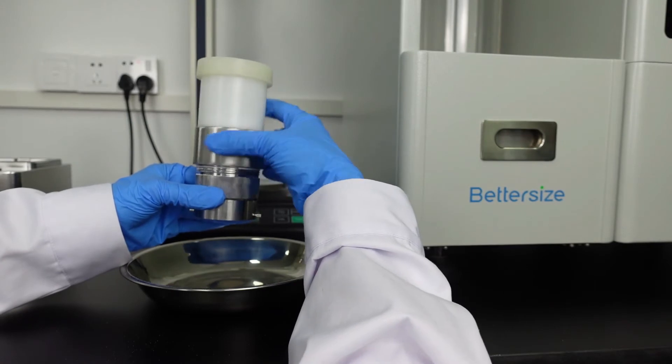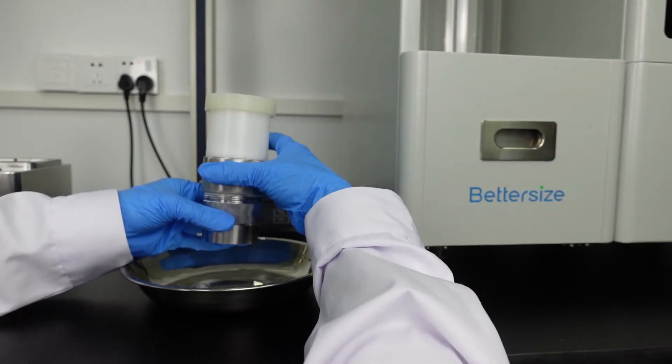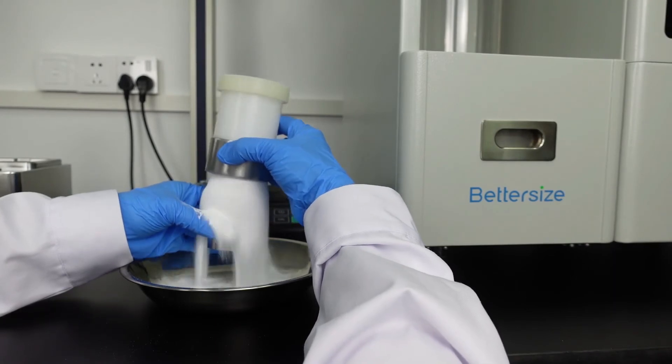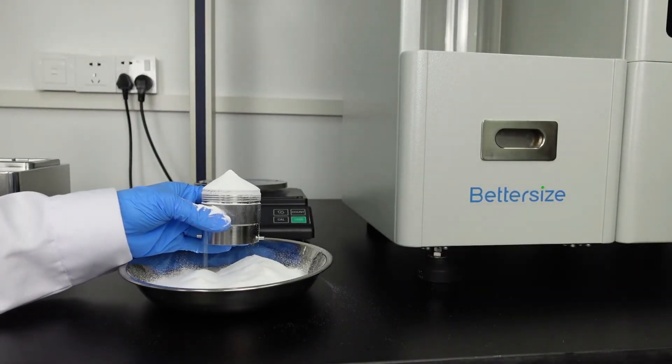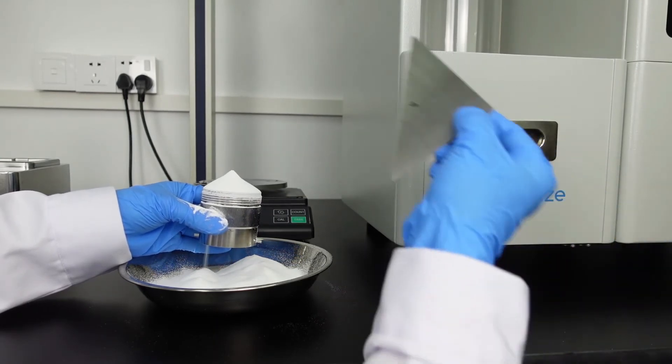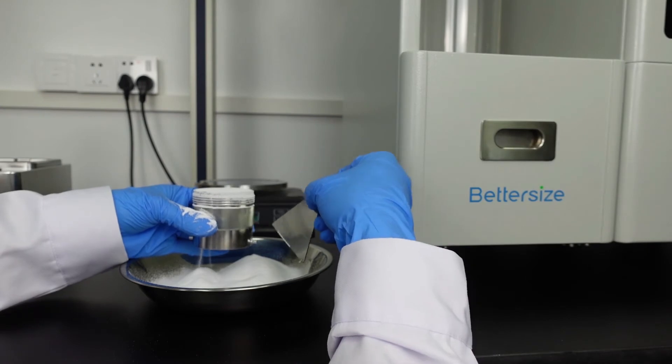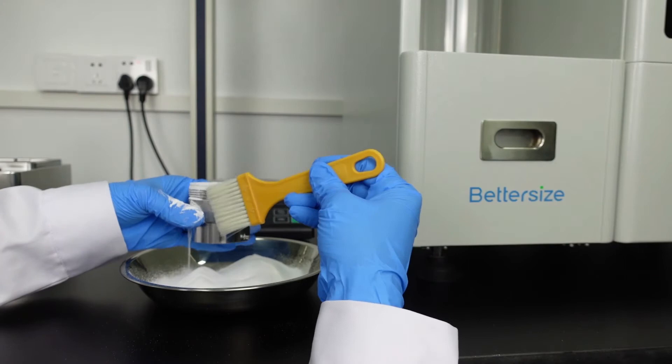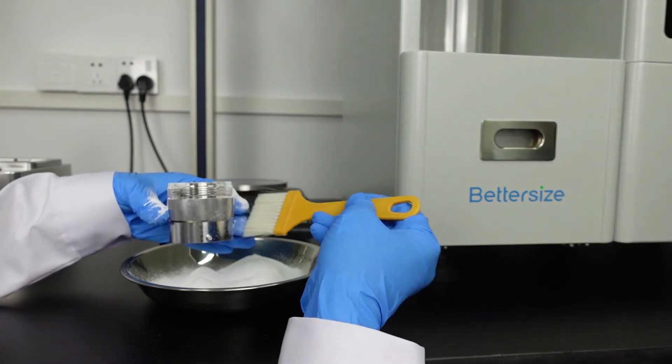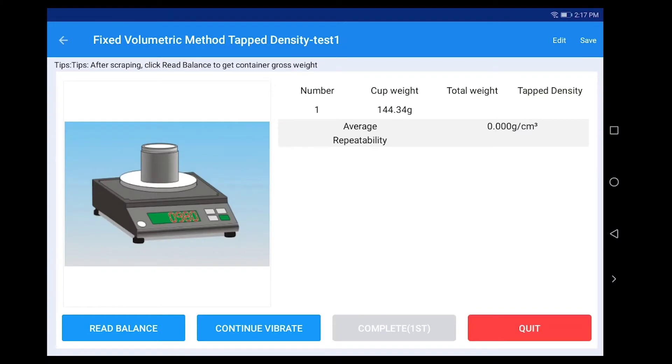Separate the 100 ml container from the extension tube. Scrape excess sample from the top of the 100 ml container with a scraper, and gently sweep the powder adhered to the outer wall of the container with a brush, and place it on the balance.